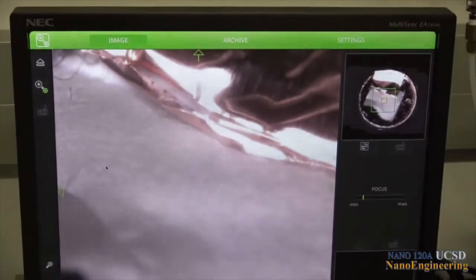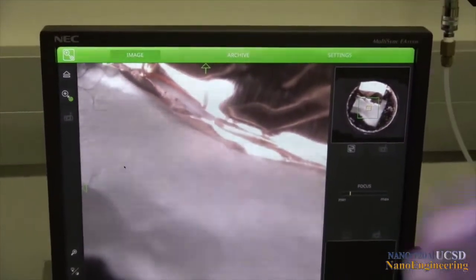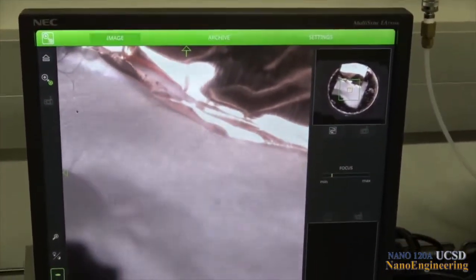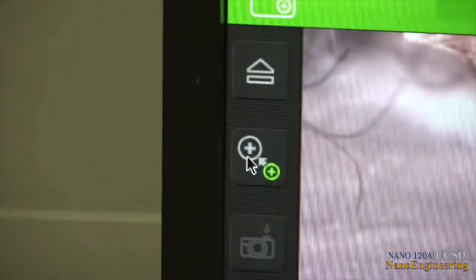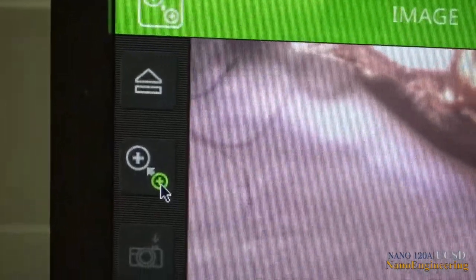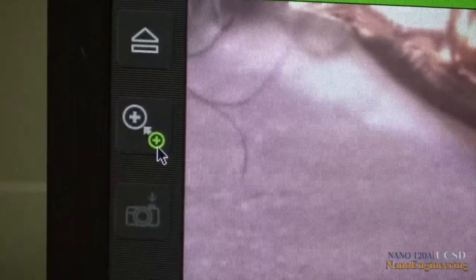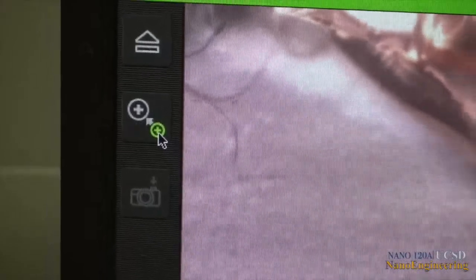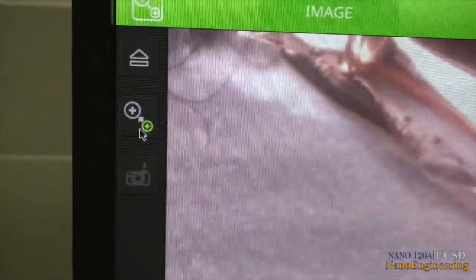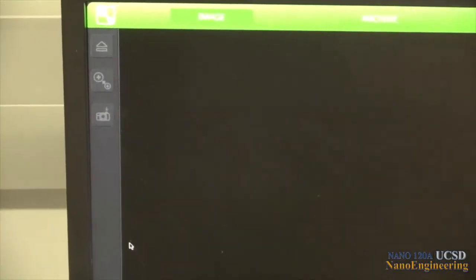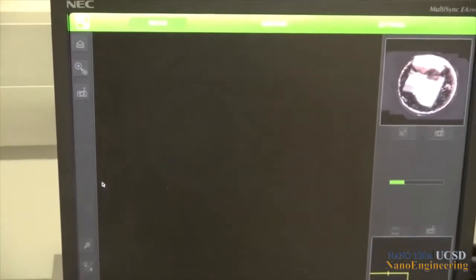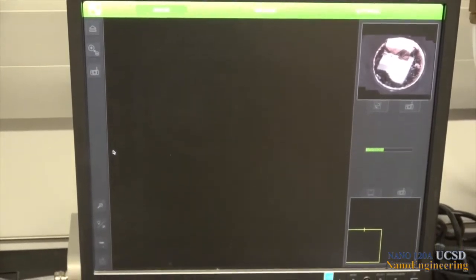After choosing our settings, we can click on the image icon at the top left of the screen and get back to our low magnification image from the initial camera portion of the microscope. To place the sample into the SEM chamber of the microscope, look to the icon on the upper left of the screen showing two plus signs, one smaller and one larger. The smaller one is lit, meaning the sample is in the initial low magnification camera region. Clicking on this icon moves the sample to the SEM portion of the microscope.